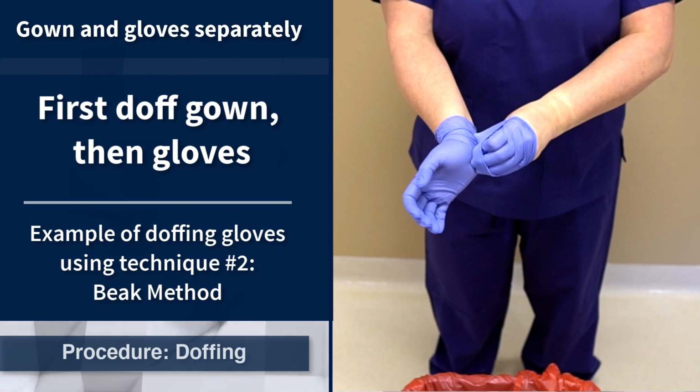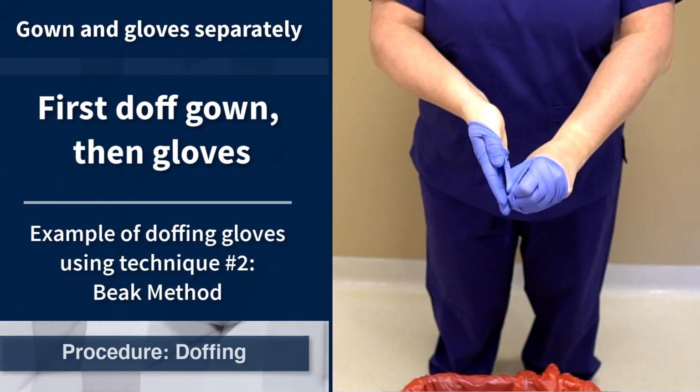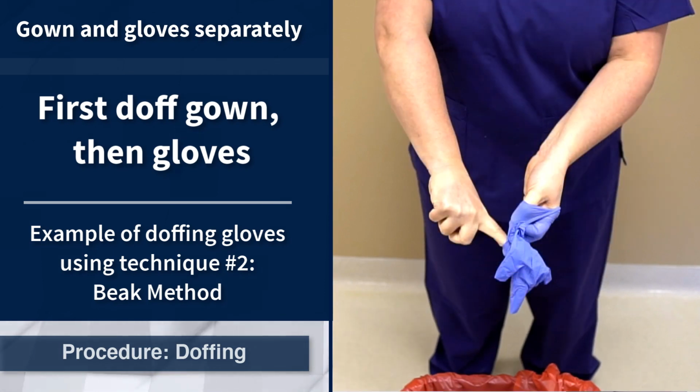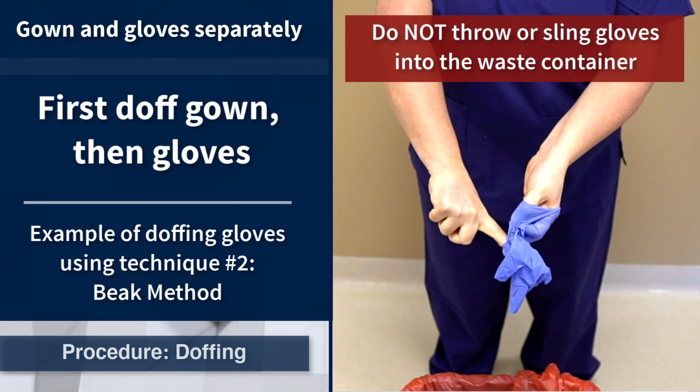Use the beaked hand to pinch the wrist of the other glove, pull it down and off. Slide the index finger of the ungloved hand into the inside of the glove and slide it off. After the gloves are removed, dispose of them safely. Do not throw or sling gloves into the trash.